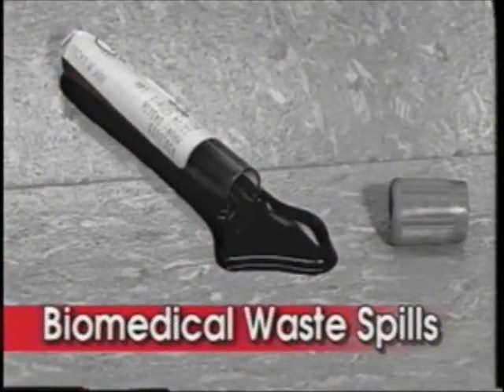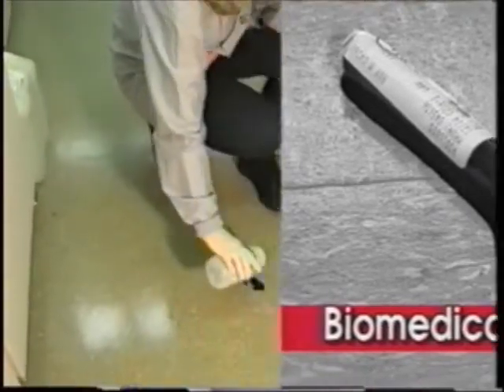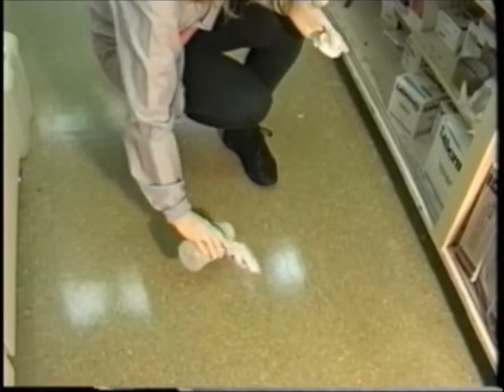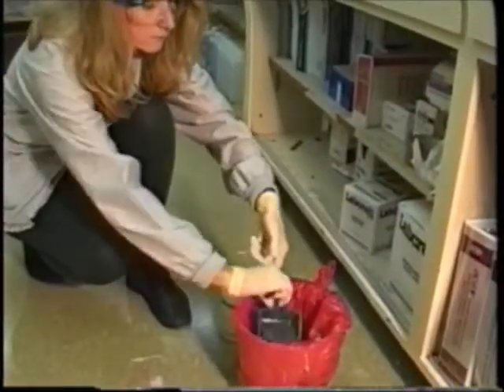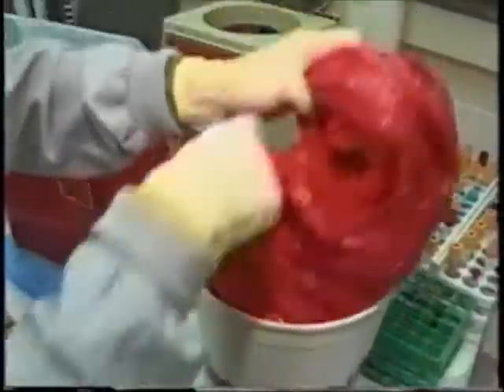What happens if the dropped bag in the indoor storage room splits and spills its contents, or you spill biomedical waste such as this vial of blood? If in the packaging, transfer, or transport of biomedical waste, any surface is contaminated with spilled or leaked biomedical waste, all such surfaces shall be decontaminated as a part of the cleaning process. Notice the decontaminating agent and waste are placed in a red bag which is tied and disposed of properly.